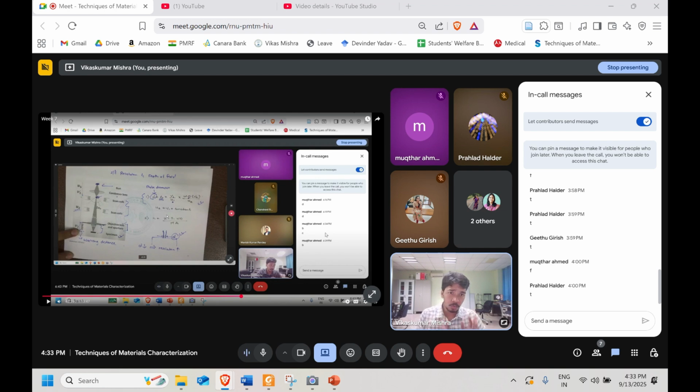So there are two types of magnification. One is effective magnification, and one is just a normal magnification which we are doing, where there is no further information. So when we are concerned about the effective magnification, whatever we discussed in week 7, whatever is going to affect the resolution, in the same way it is going to affect the magnification also. Okay.